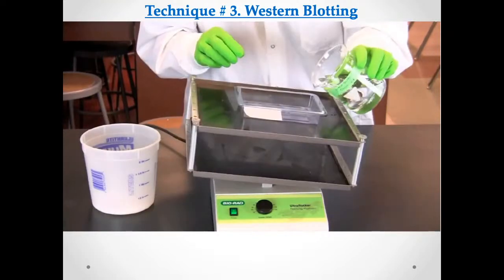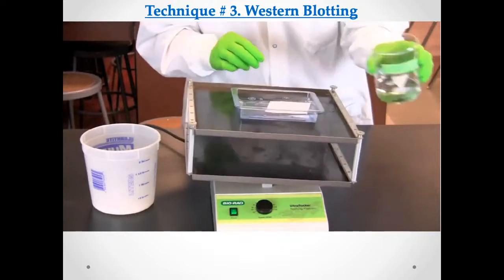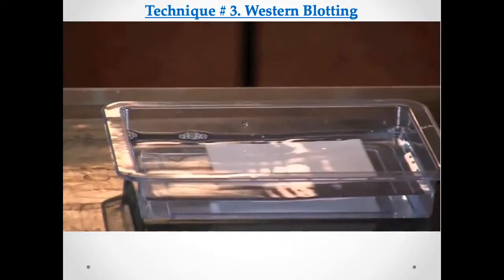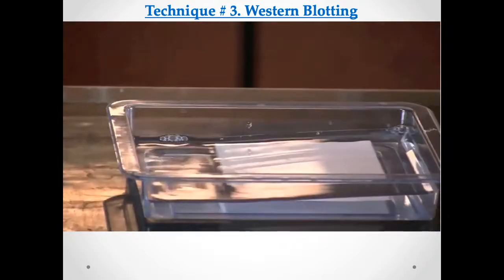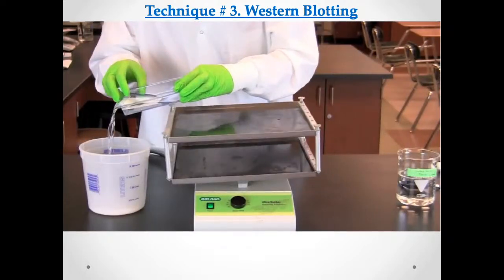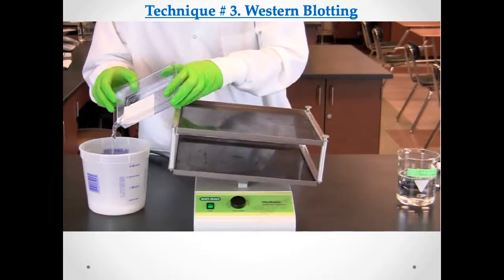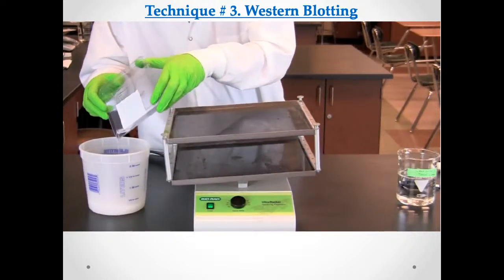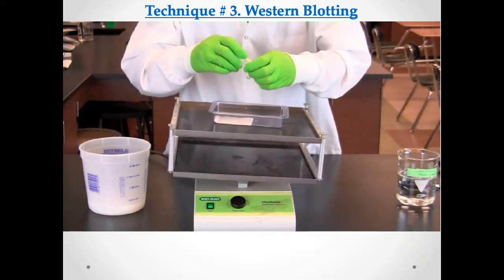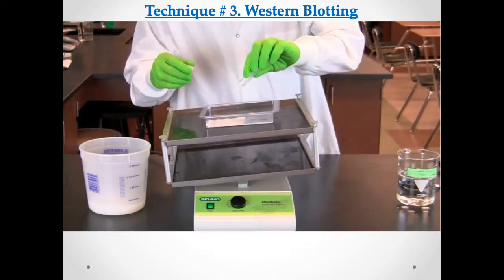Add another 50 milliliters of wash buffer to the membrane and let it wash for 3 minutes on the rocking platform at a medium speed setting. Discard the wash buffer. Add 10 milliliters of secondary antibody and incubate the membrane for 5 to 15 minutes on the rocking platform at a fast speed.